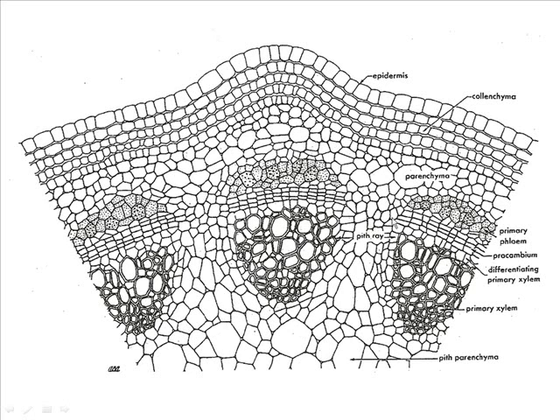Well, just kind of imagine the middle of these vascular bundles. So up here would be cortex parenchyma, down here pith parenchyma. In each bundle we see what? We see primary xylem, and we see primary phloem, and there'll be something else on top of these particular ones you looked at. But then we have procambium or residual procambium in there, at least for a time.